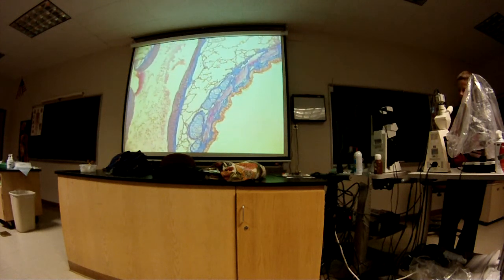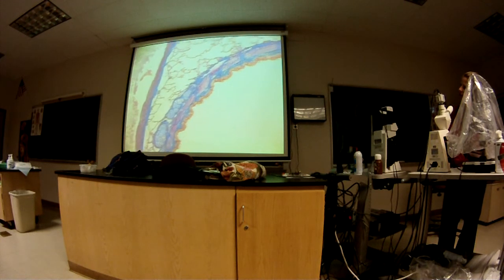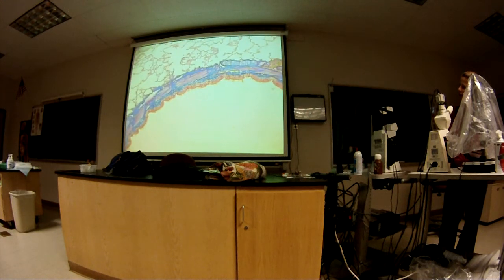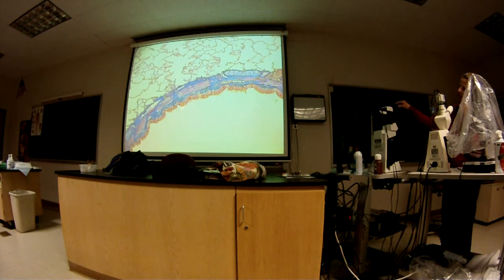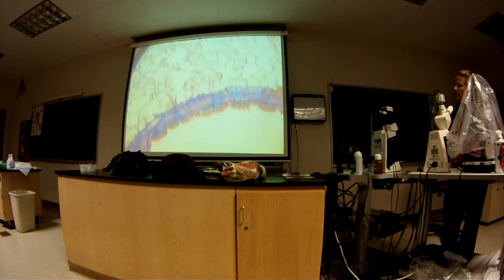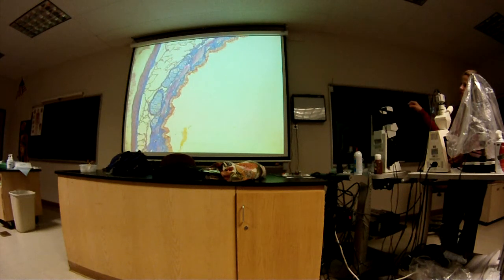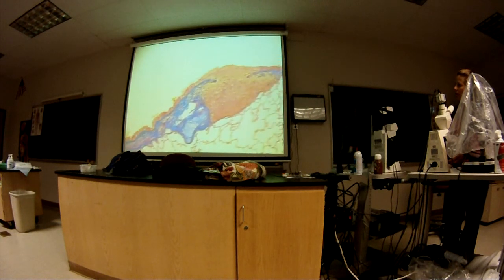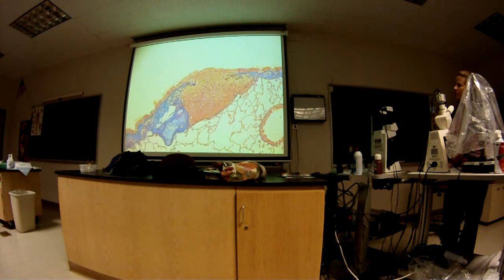Okay, so here's the structure we're looking at. Alright, so you see the epithelium, the cilia. So what must this be? We see hyaline cartilage. It's a bronchus. There's smooth muscle. This is actually better than the other one we were looking at. These are the hyaline cartilage plates, and the smooth muscle going around the wall of it, and then there's this structure.